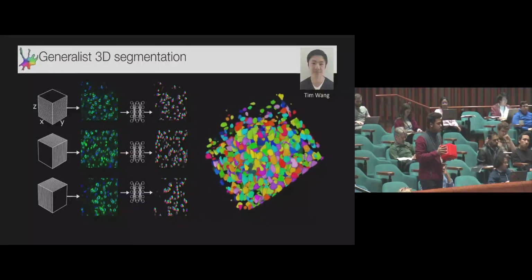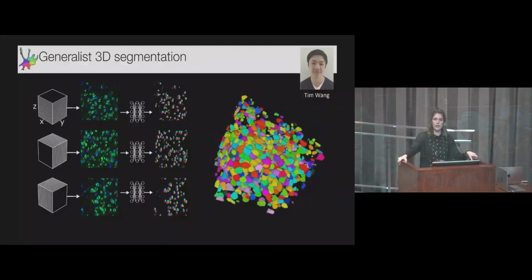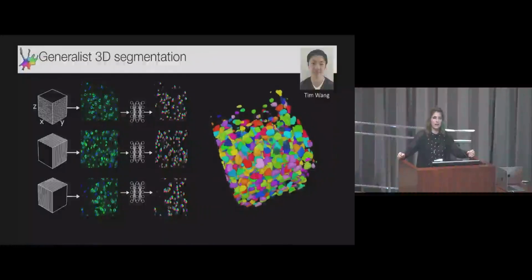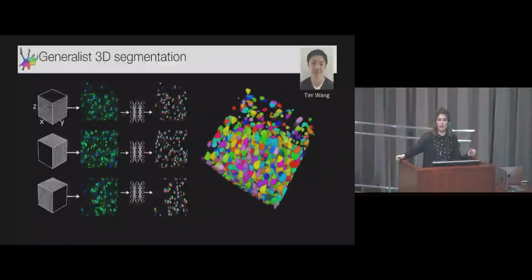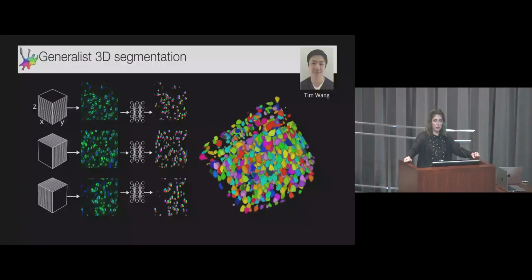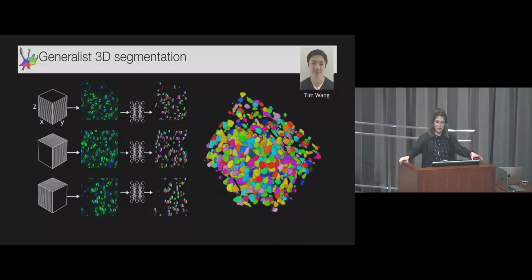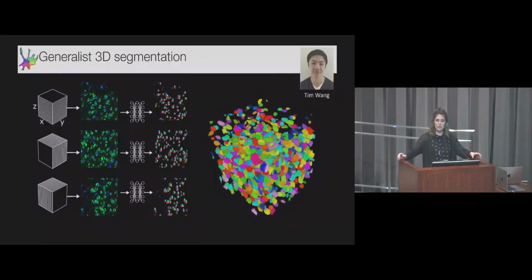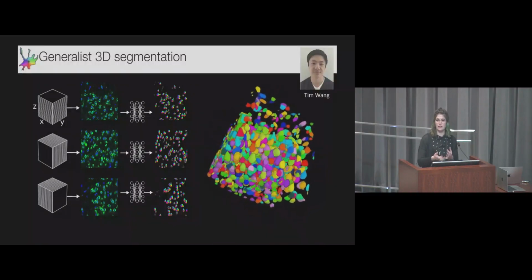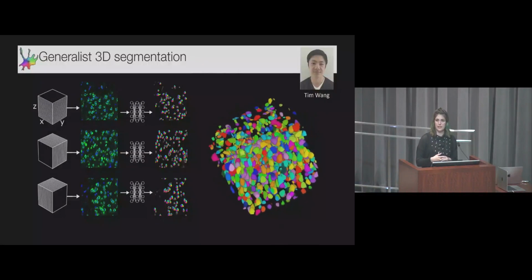That's a great question. We've also tried larger UNets. They're much slower, so they've never been that big. I think transformers have this real advantage that they're much faster and can have a really large capacity compared to the UNets. It would take a really long time to train a UNet with 307 million parameters, so we haven't tried that. I think it is just an issue of how well these models can scale to larger sizes, and that's the advantage with the transformers. Thank you. Yeah, it's a good question.